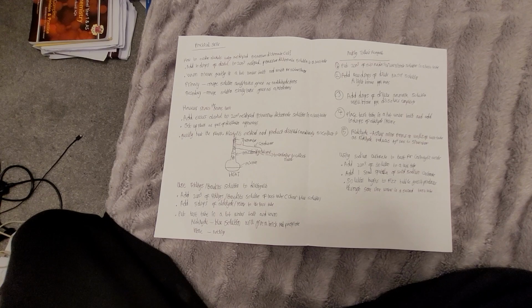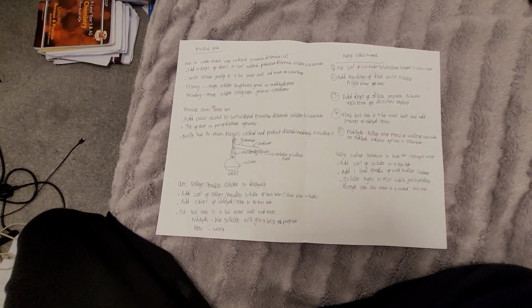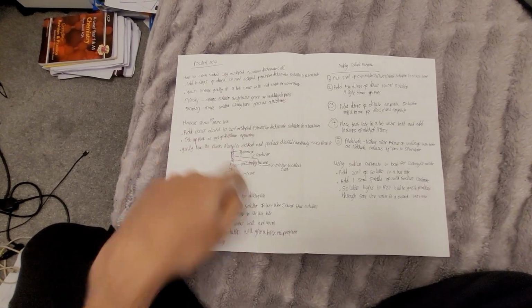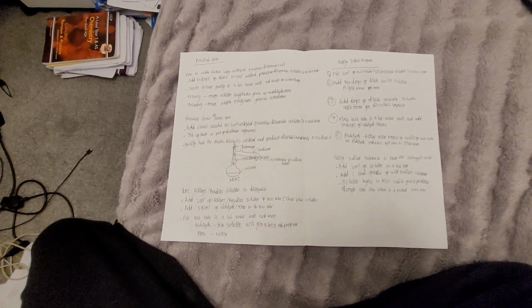Watch for a color change. If it's a primary alcohol, the orange solution slowly turns green as an aldehyde forms. Secondary alcohol, the orange solution slowly turns green as a ketone forms. And tertiary, nothing happens. However, they show the same test, orange to green, for an aldehyde or a ketone.